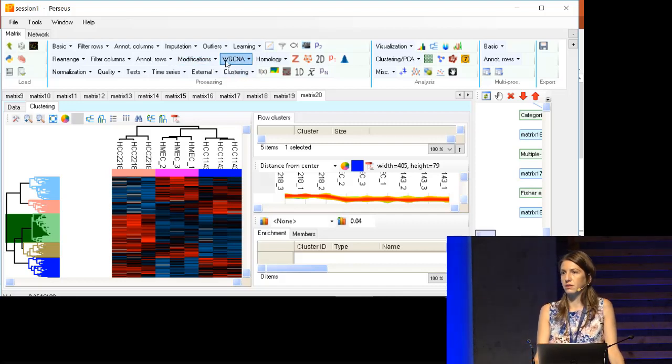Okay, is there possibly another reason why if you use the same data set but you conduct the ANOVA in log scale versus raw LFQ values, you can get a different number of significant hits? Actually, you shouldn't use it on the non-log data because in our case, 0 means it's not detected. So it's not a real value. It doesn't mean 0 expression, but rather not detected. So you don't want to do this, yes. So you will get definitely different results.